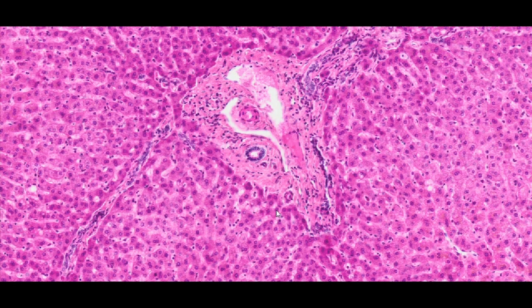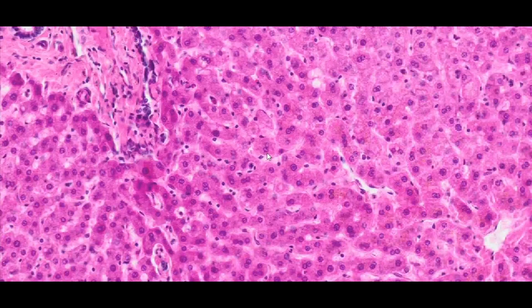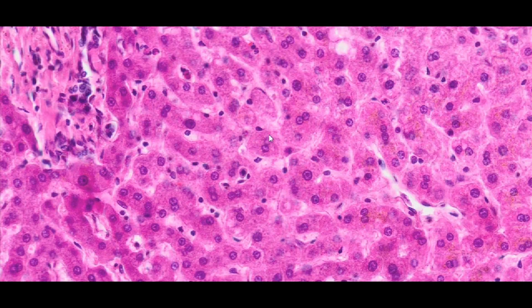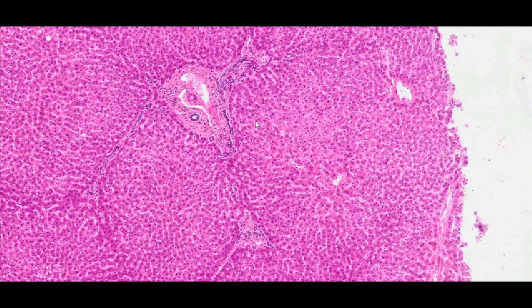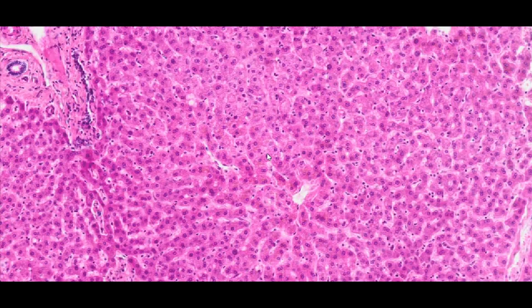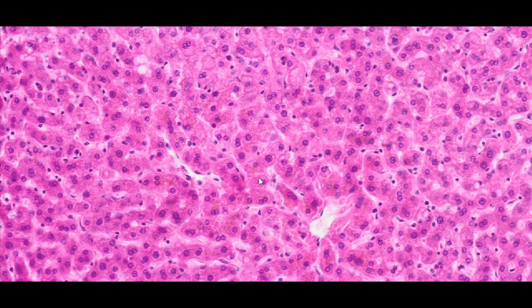The cells that build the hepatic parenchyma, i.e. hepatocytes, are large polygonal cells with round nuclei, sometimes two, arranged in irregular lamellae that radiate towards the central vein. Each lamella is made up of one or two rows of closely adjacent cells, and is the width of a single hepatocyte.